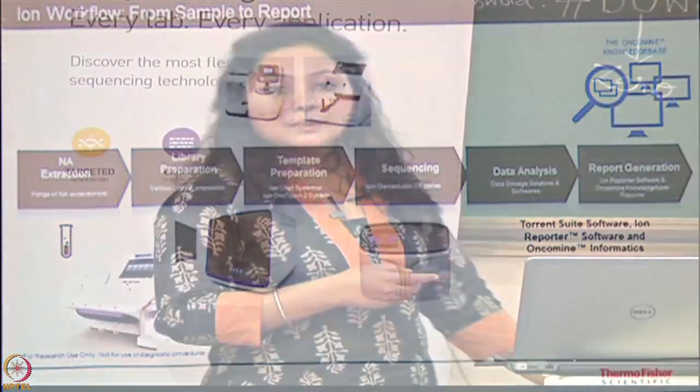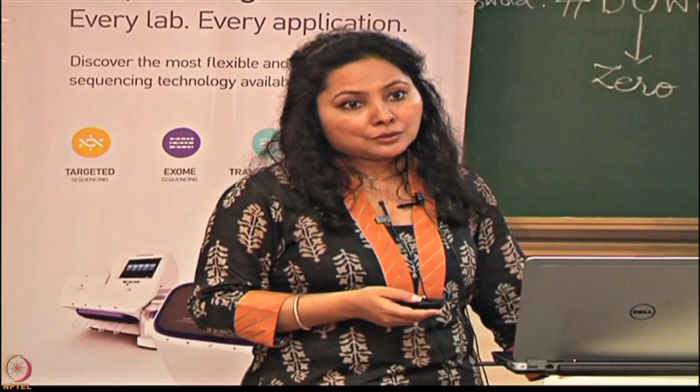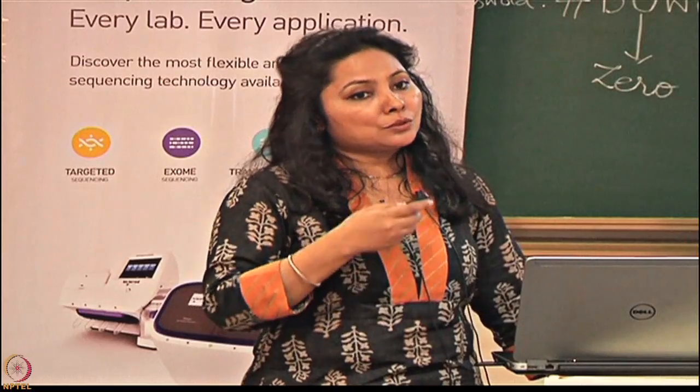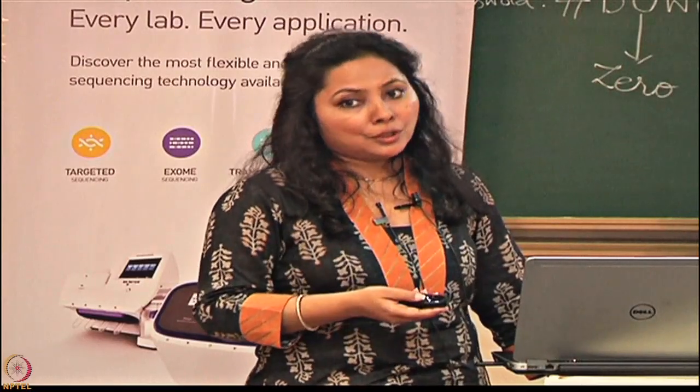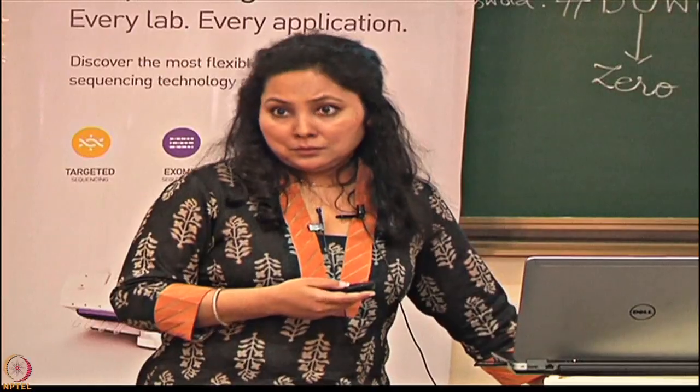Then comes sequencing. Now you have your ion spheres which are templated, which have library molecules amplified onto them, and now you want to sequence. So you load these ion spheres onto the chip and then you generate the data.